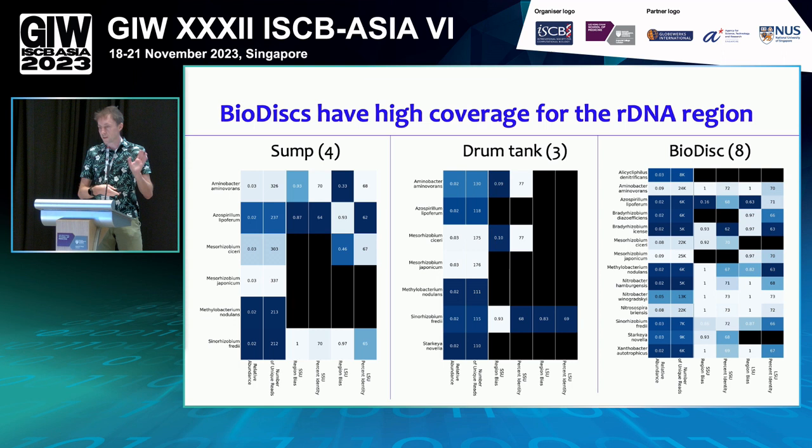So the way to interpret this plot is that if we take this example here of 70%, what this means is that these bases are 70% similar to the reference genome at the individual base level. And then on the left here, this is a ratio from 0 to 1, where 0 is no similarity and 1 is complete similarity. Complete coverage or breadth.